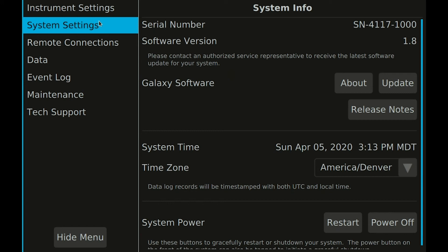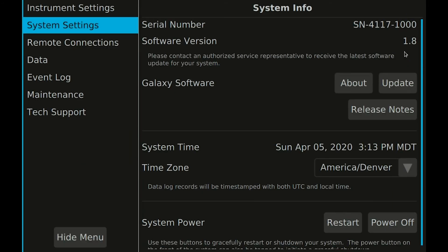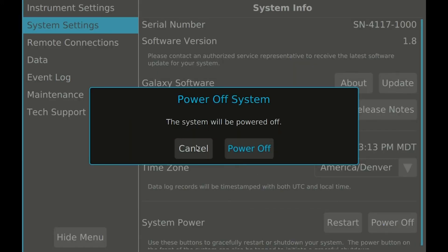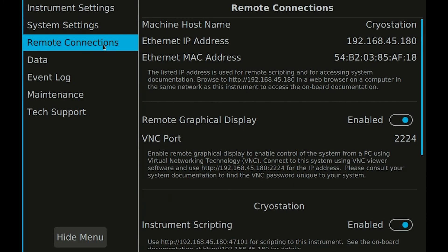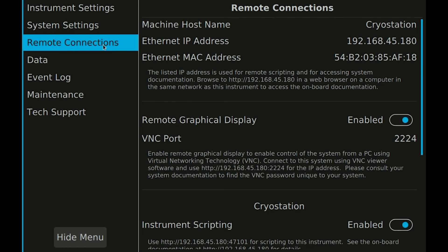System settings contain information like serial number, software version, release notes, and your system's time zone used when logging data. There are also buttons for gracefully restarting or powering off your system. The remote connection settings allow you to enable and disable different ways to control your system remotely. These features require that your system has been connected to a network using an ethernet cable.